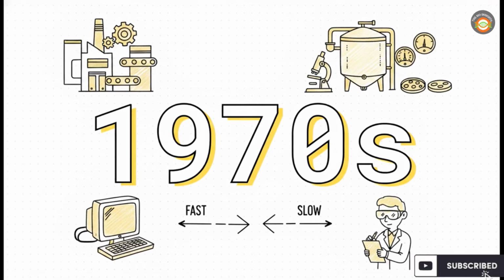We have reached the climax of our tour. We've looked at the hardware, the pH probes, the infrared CO2 sensors, the galvanic oxygen probes, and the manometers. Now, we finally meet the digital brain that oversees it all. But I've got to share a really surprising piece of history with you.